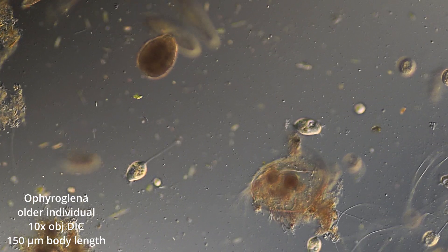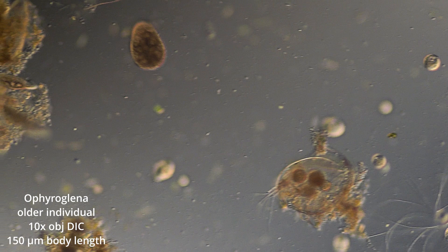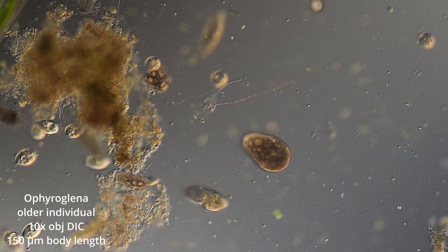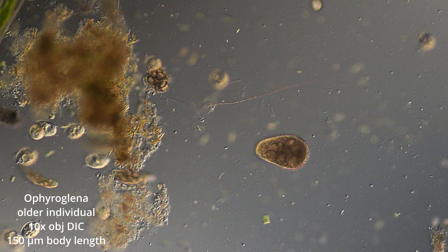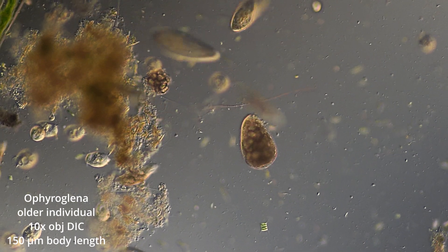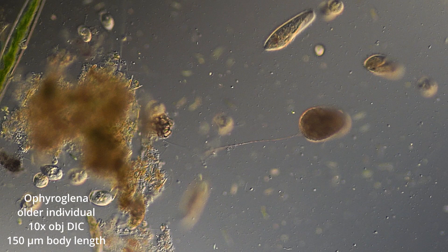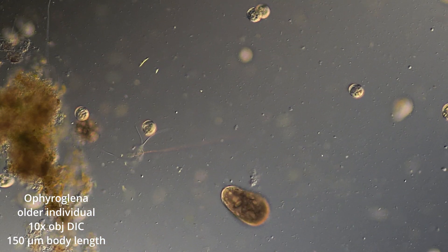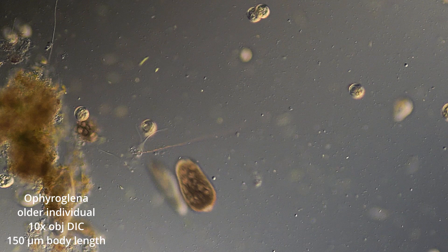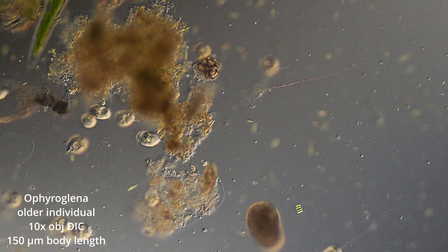Hi, here we have Ophira Glena, shown here using a 10-power DIC objective. The body length is about 150 microns. This one appears to be in late-stage development, where they seek out a darker environment, become brownish in color, and they're stuffed with food vacuoles.